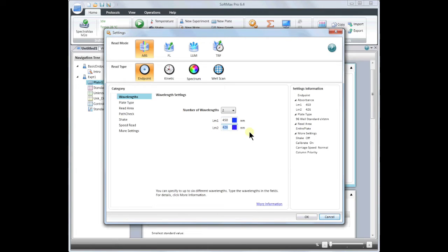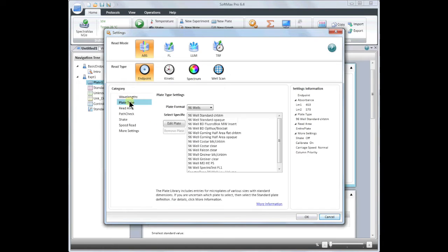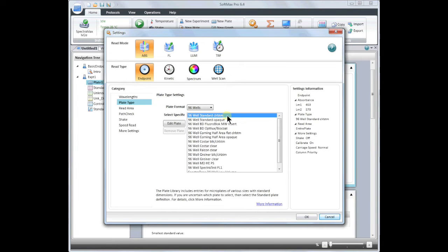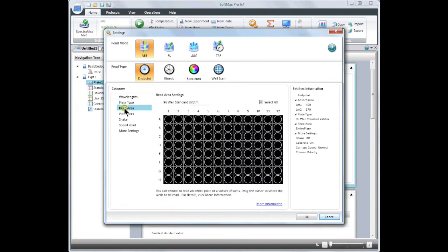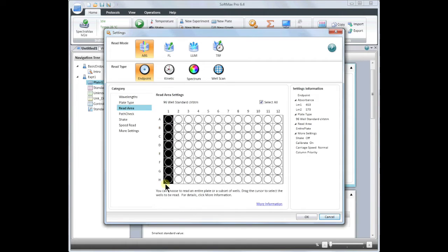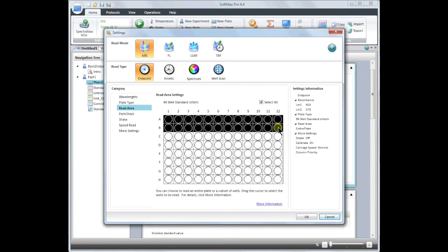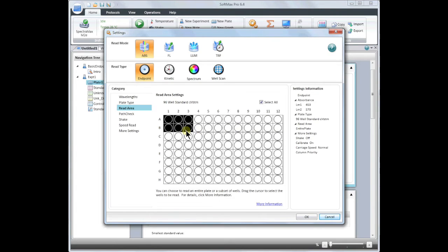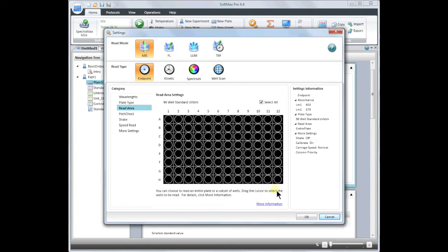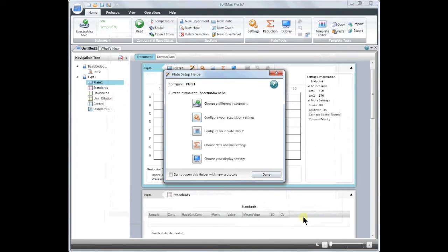Next, select the plate type you will use. For an absorbance assay, you need to use a clear plate. Then you may select whether you read the entire plate or just a small portion. Please note that the wells selected must be contiguous. When you are finished with your selections, click OK.